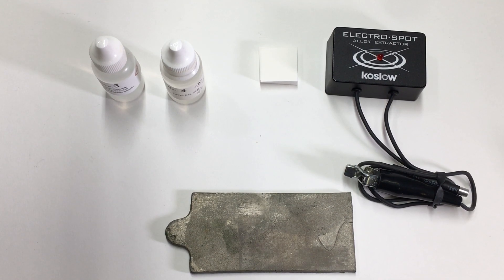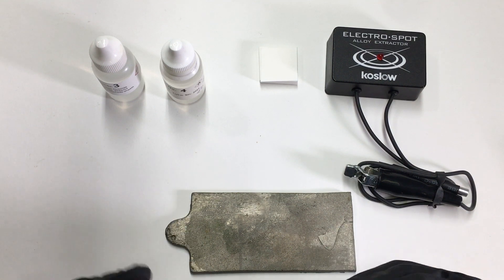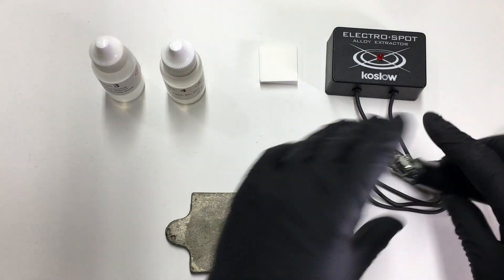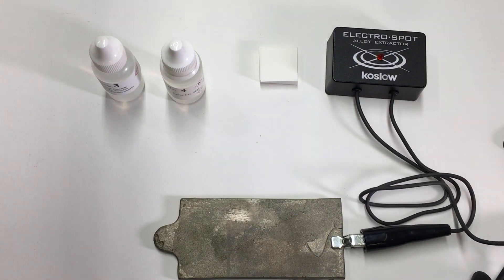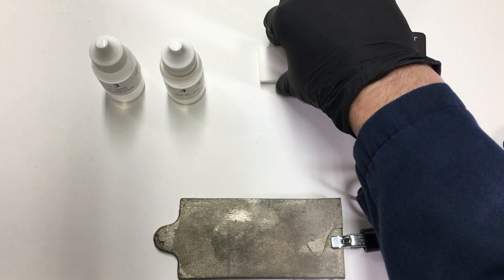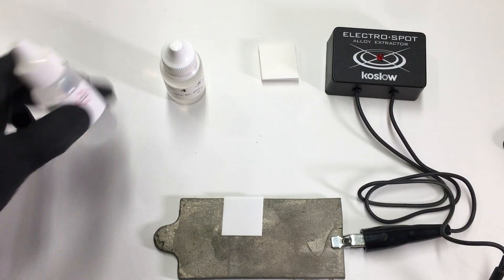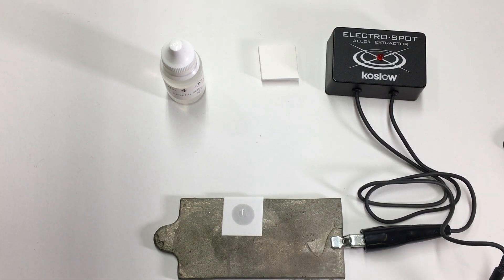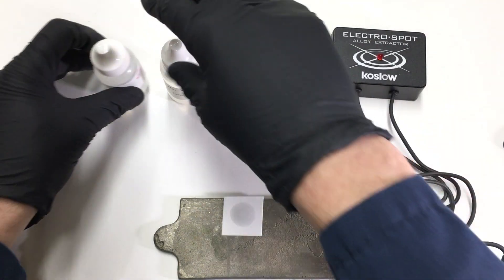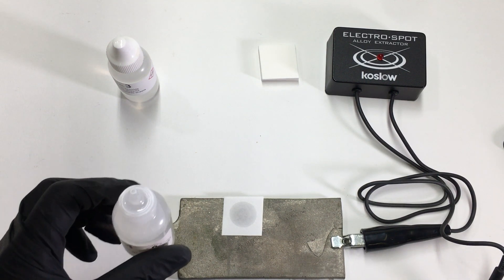Let's find out if this material is either nickel or contains a nickel coating. This may be the most inexpensive method for verifying metal alloys. This test kit is found in the 1598 plating test kit. It's also found in the inspector's kit 1499.